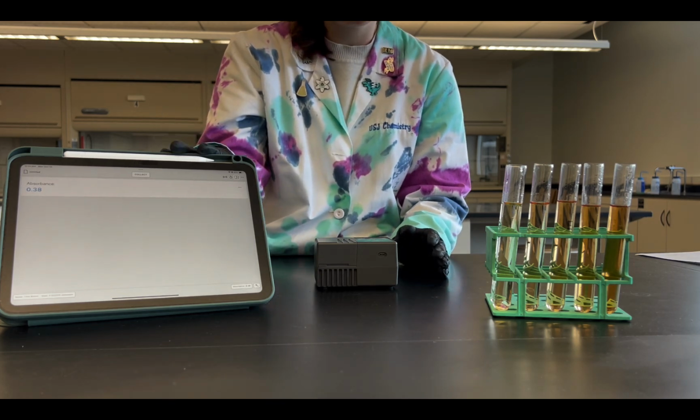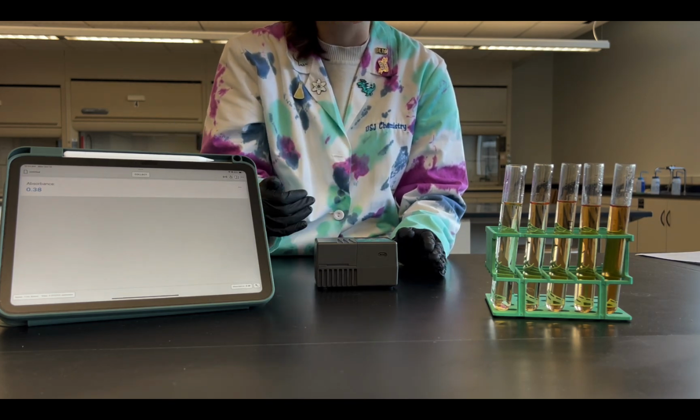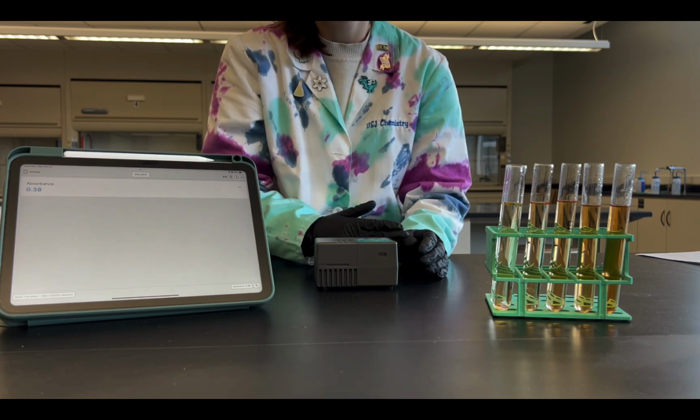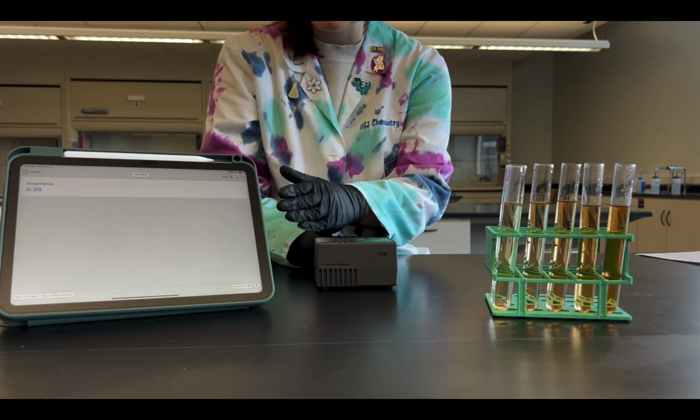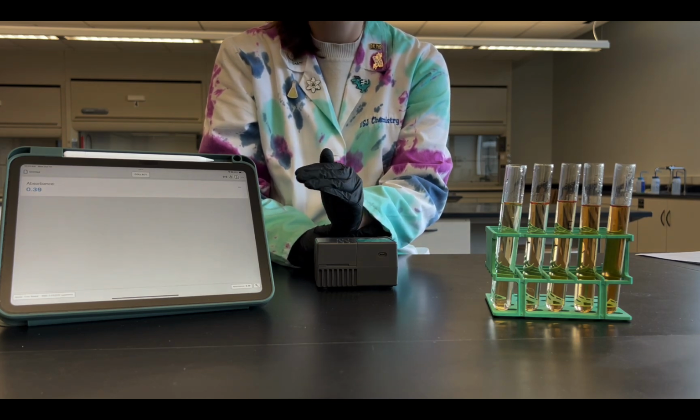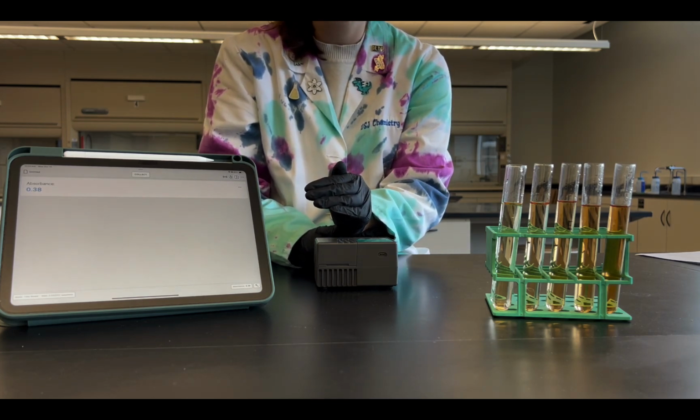So this is a really great way to look at, as you go through the lab, if all of your solutions were made properly. So now what we're going to jump to next is taking these absorbances and plugging them into our Excel plot in order to make our standard curve.